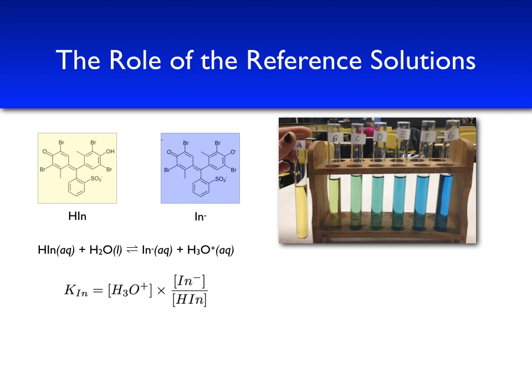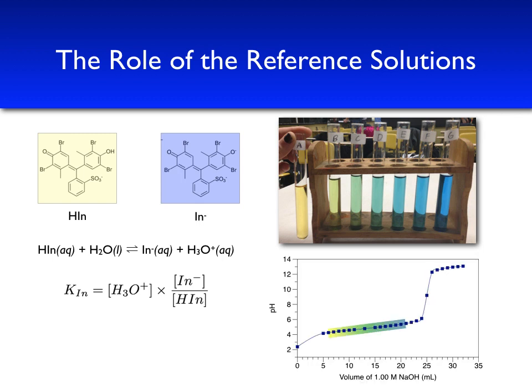Typically, an acid-base indicator changes color around the pKa of the indicator itself. For bromocresol green, this color change is between around pH 4 and pH 6. If you look at the figure of the titration curve, you see that this color change range coincides with the buffer region of acetic acid. Therefore, we can use our color matching to figure out the ratio of acetate and acetic acid.